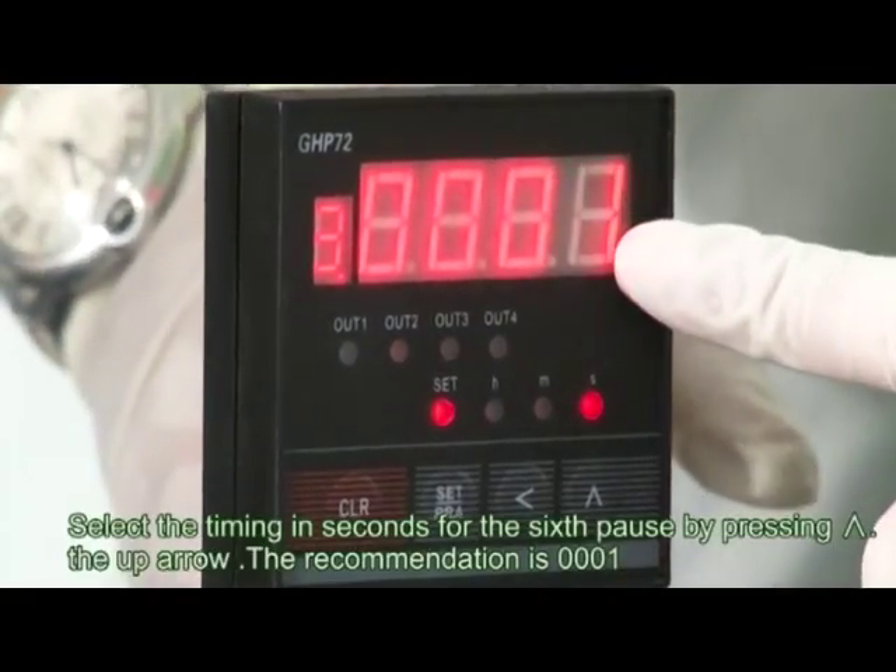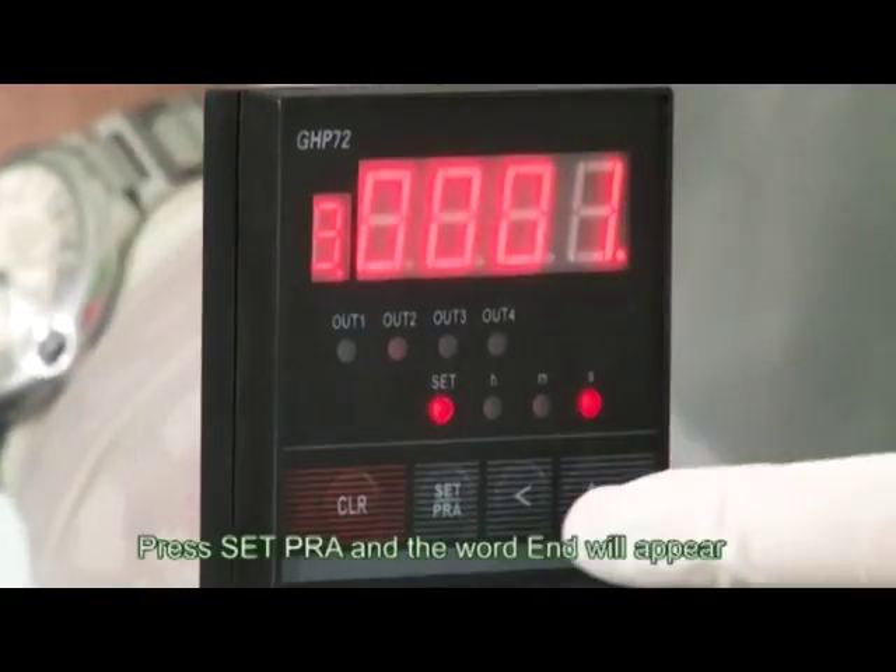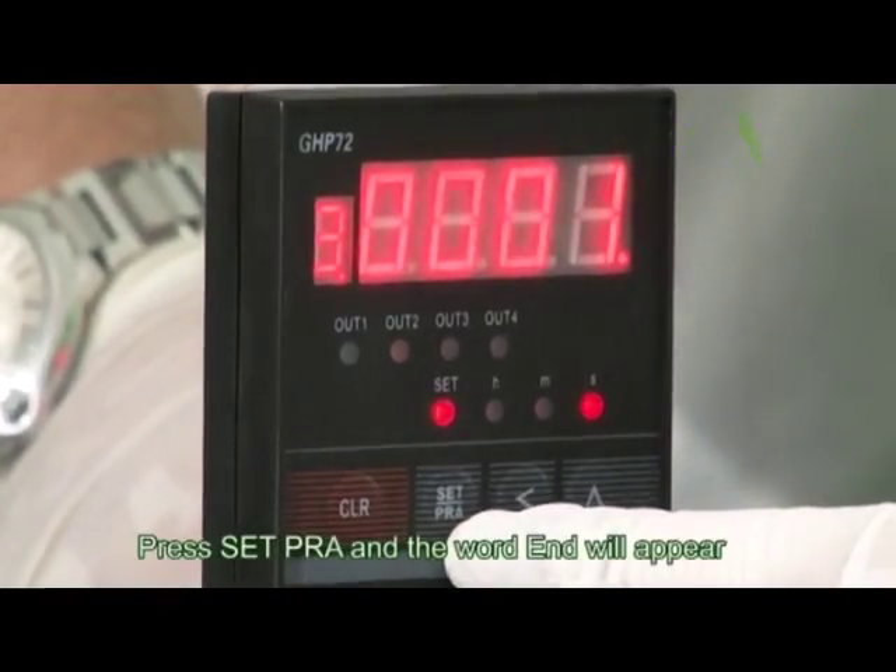Select the timing in seconds for the sixth pause by pressing the up arrow. Press Set Pra and the word END will appear.